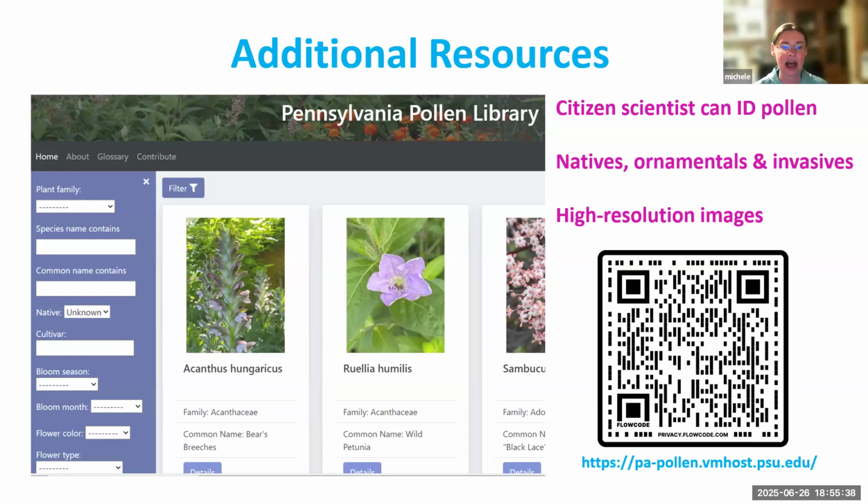And actually it was really fun. I helped build a good part of this library. I did not take the microscopic pictures, but I did process all the slides that went into the pictures that were taken. And probably a third of what's in this library came from my yard, because I have a plant problem.